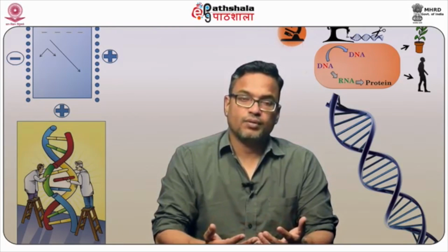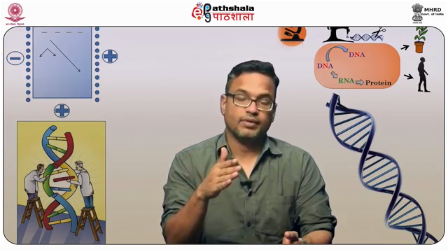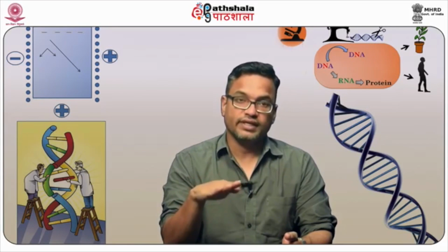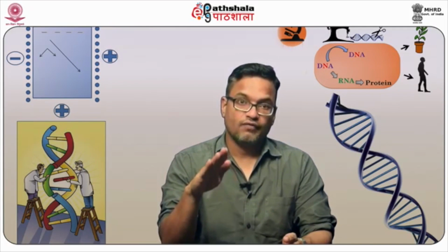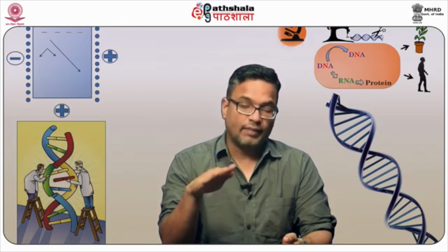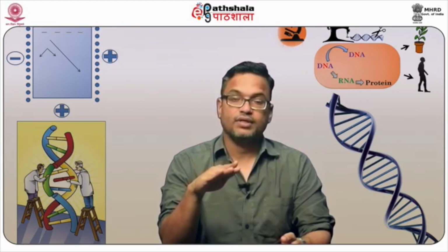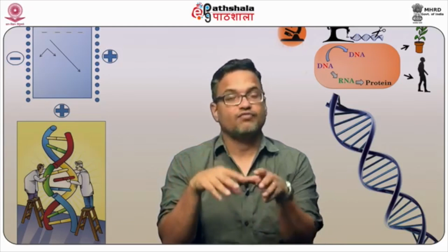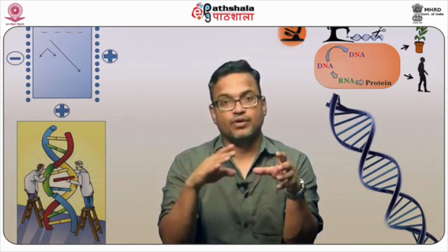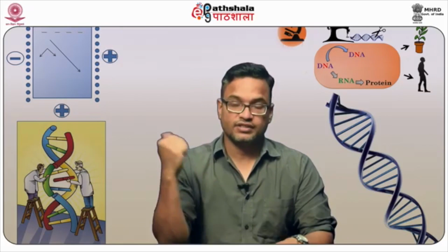The second is the scanning probe microscope, where instead of using either an electron beam or light to illuminate the sample, the sample is probed physically. For example, in the atomic force microscope, you have a cantilever which you are actually tapping on the sample, and whenever there is contact between the probe and the sample, this information is captured by the computer, and then used to generate a three-dimensional map, because it continues to tap and look at the surface of the sample, and whenever there is a contact, that information is registered.